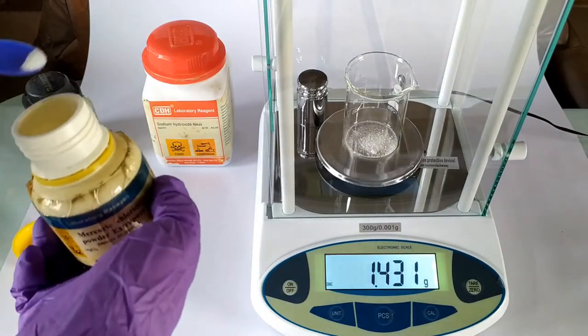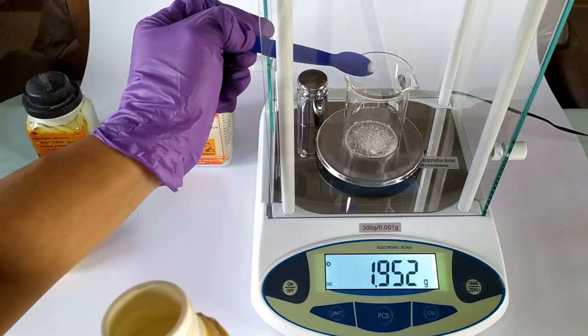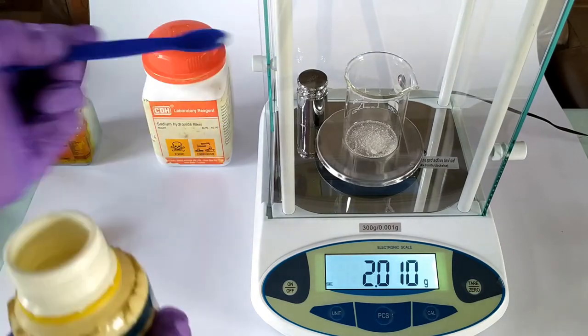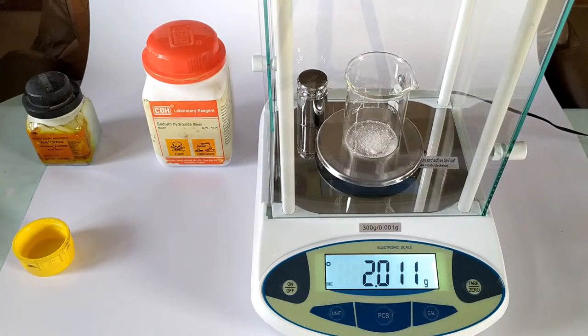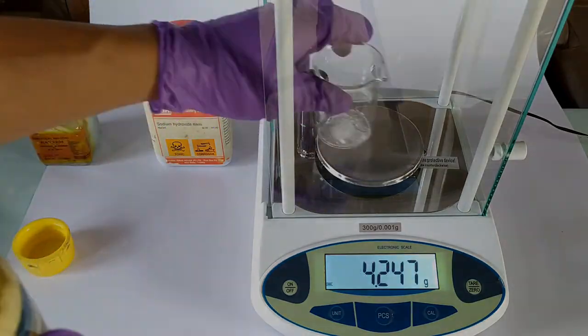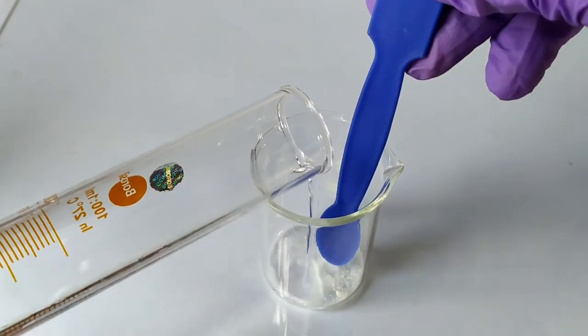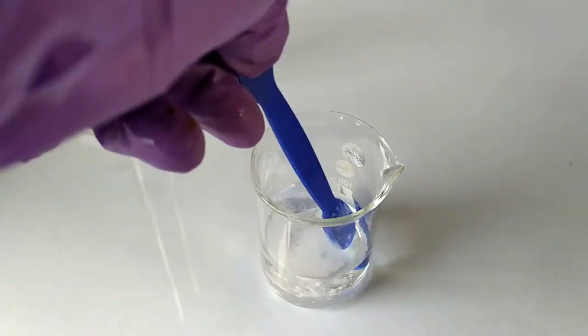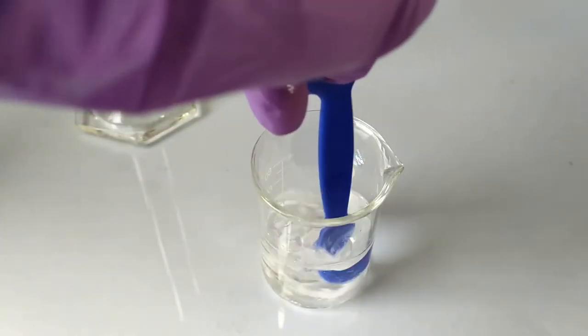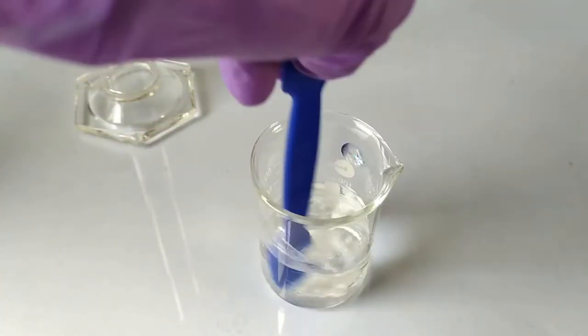Now weigh about 2 grams of mercury chloride using the second beaker. Add to this about 40 to 50 ml of water and continuously stir the contents until the mercury salt is completely dissolved. This might take some time. Also keep this beaker aside.